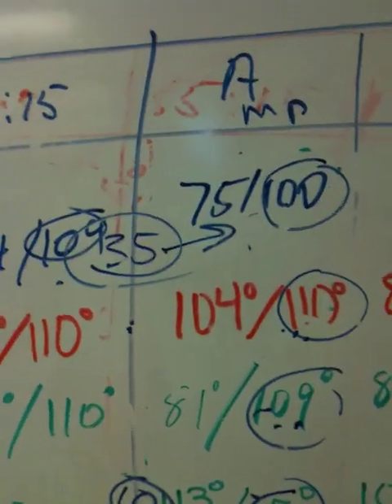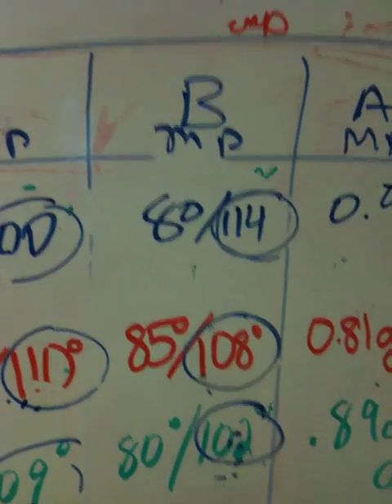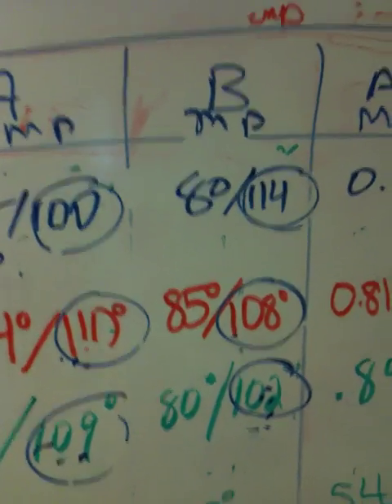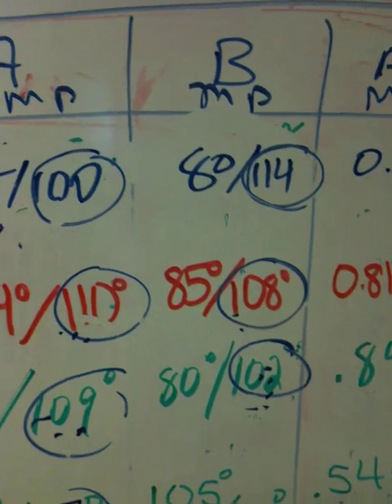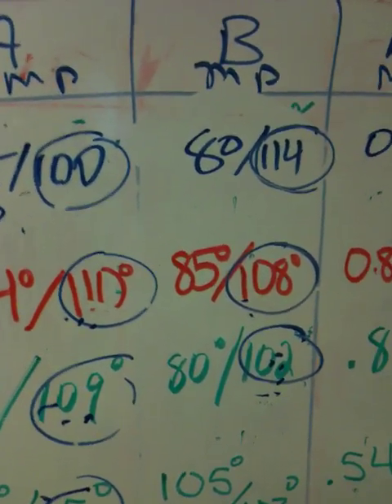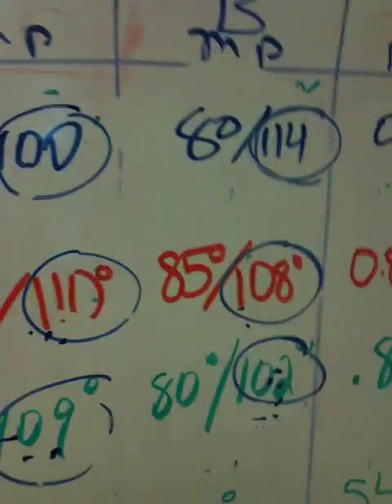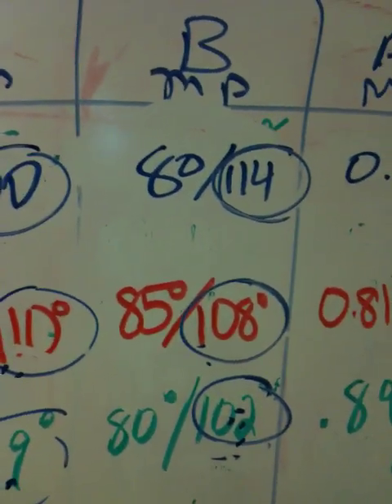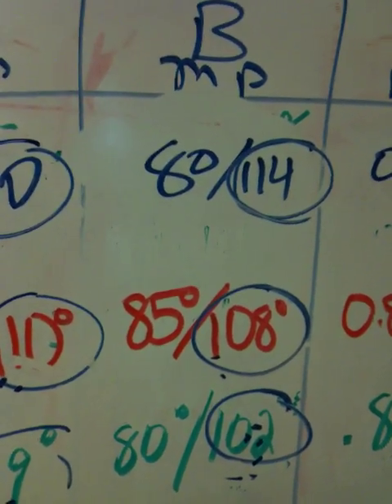The other issue with growing crystals quickly, of course, is that you form many small crystals, and the small crystals tend to have a large surface area because they nucleated very quickly, and in doing so, they tend to have more material attached to them. Also, the B sample was brought down to 0 degrees, and being at 0 degrees means that it's more likely that the contaminant salicylic acid will exceed its solubility limit and come out.